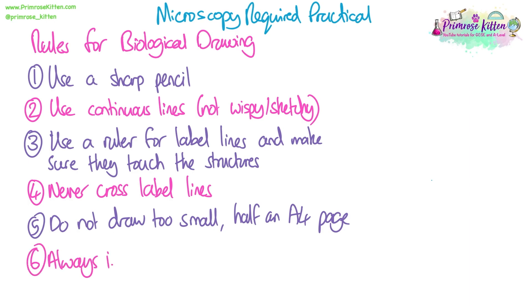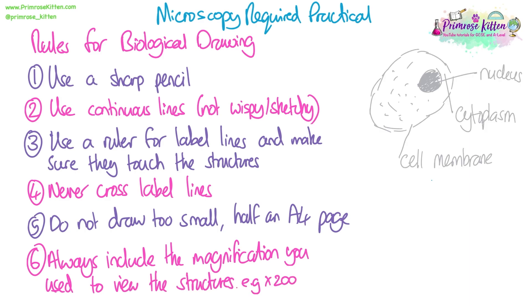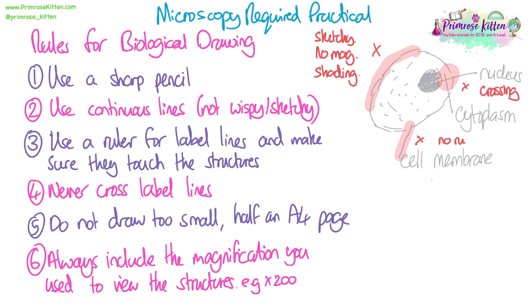You always need to include the magnification you used to view the structures you drew. Here you can see an example of a bad diagram. First, I've got wispy, non-continuous lines around the edge. I've got crossing over of label lines. My cell membrane line hasn't been drawn with a ruler and it's not actually pointing at or touching the cell membrane. Also, I've shaded and scribbled in the nucleus to make it dark — that's not what we want. We shouldn't shade at all; we can add maybe dot work if necessary, but we shouldn't be colouring or shading.